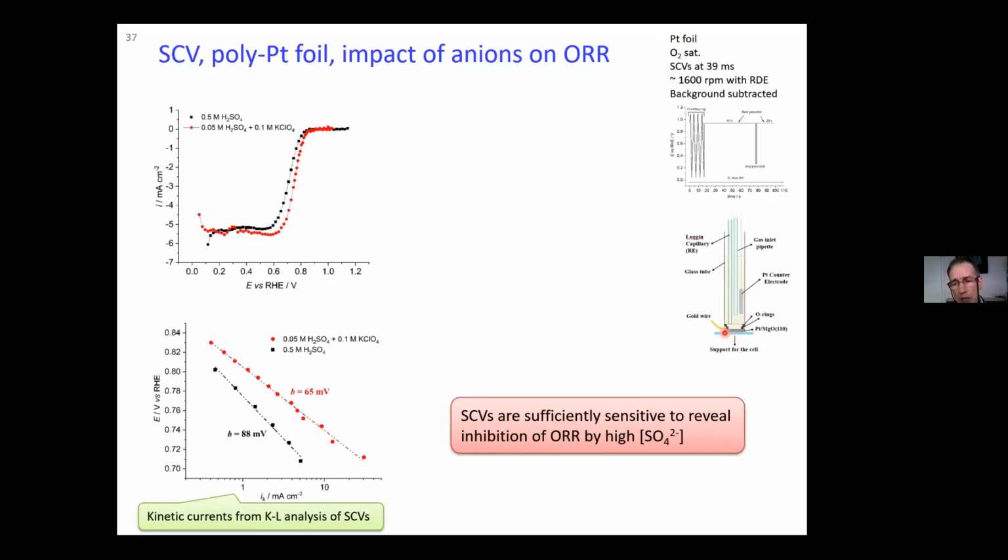It's a polycrystalline platinum foil, contacted from the top, and the solution comes from the top, and it's pressed against a support. The sample current voltammograms were performed with this conditioning waveform, and Sibel investigated two conditions.